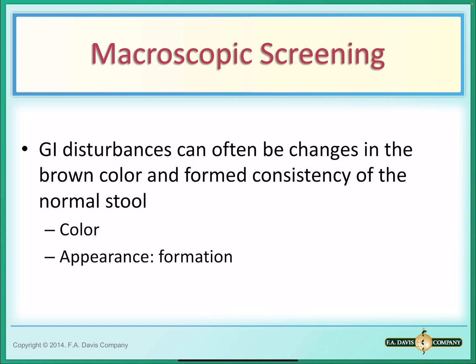Okay, so we do 3 types of testing of the feces in the lab: macroscopic, microscopic, and chemical testing.